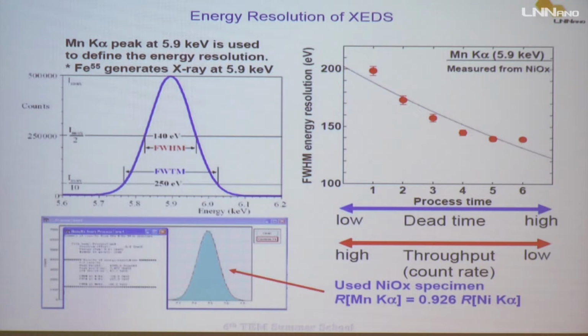If many photons arrive at the detector at the same time, it will not have time to deal with all of them, and then you can choose some parameters in your detector.